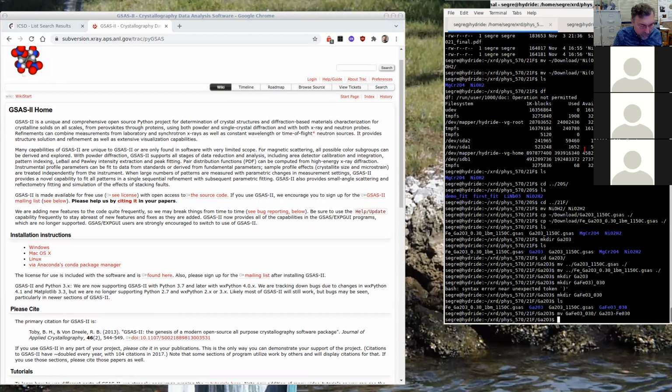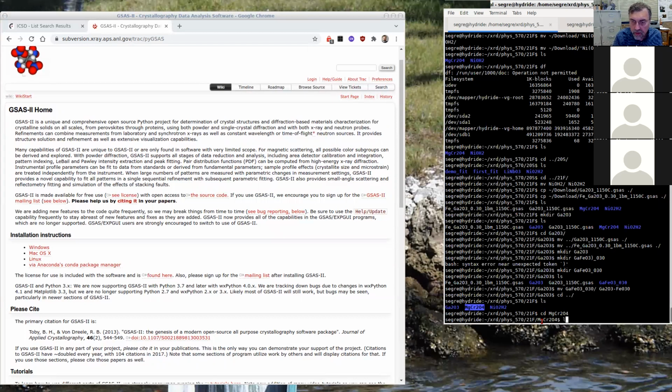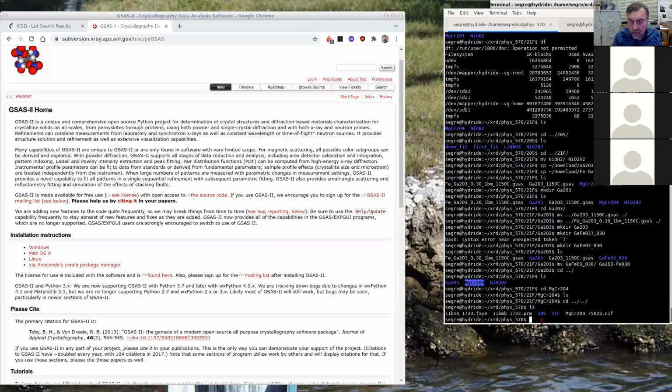So what do we have to work with today? I've set up a directory, and I have some data for magnesium chromate, MgCr2O4. And that's from 11BM. So let's go into that directory and see what we got. I don't know if I put anything in there yet. No, nothing yet. So I have to go up a couple of directories, and I'll show you what we get from 11BM.